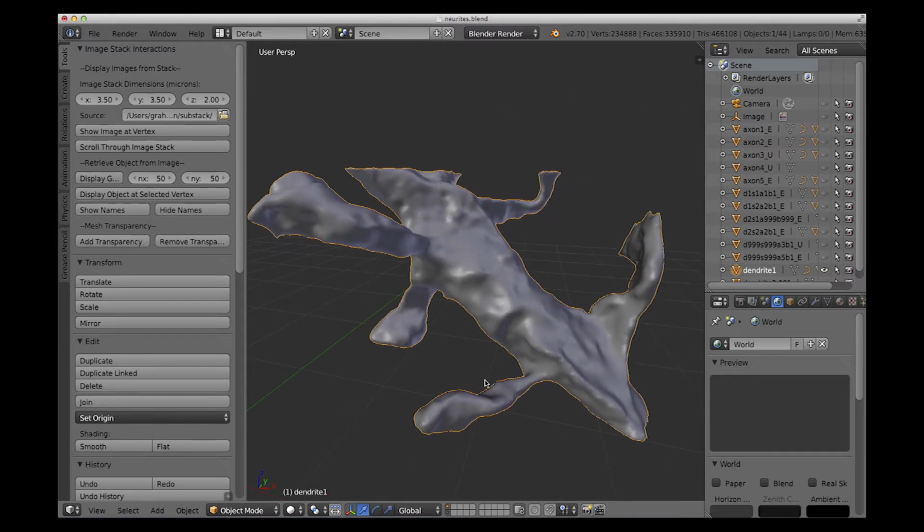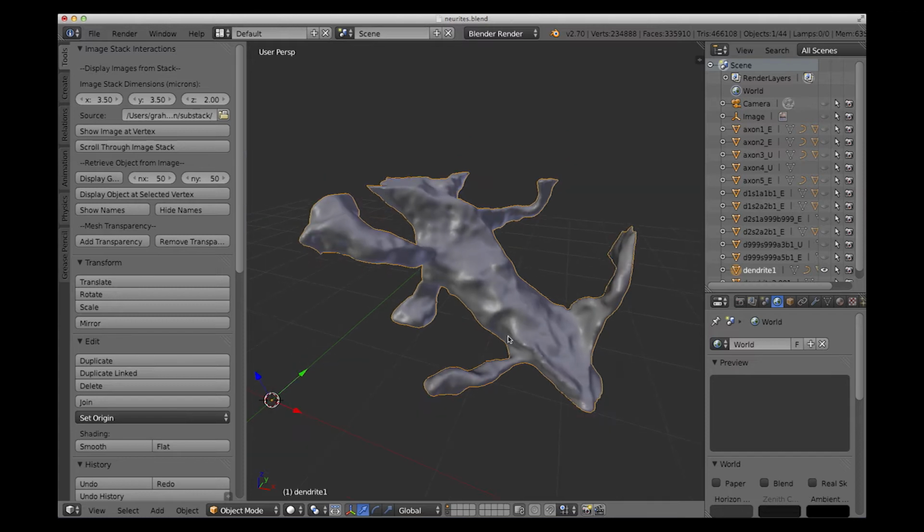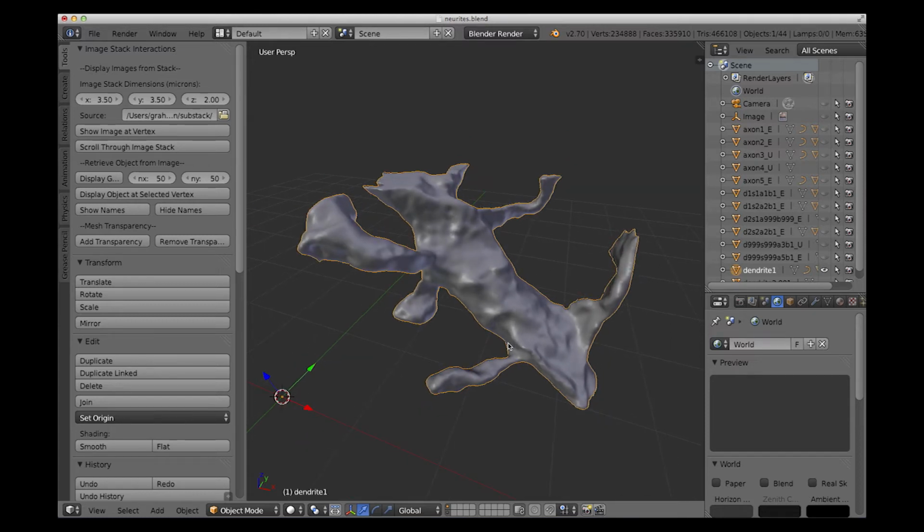But we can also make this manually using software, for example, like the TrackEM2 software that operates in Fiji. So the NeuroMorph tools allow us to make these morphometric measurements, but it also allows us to check how accurately this model is a reflection of the structure that we've imaged.